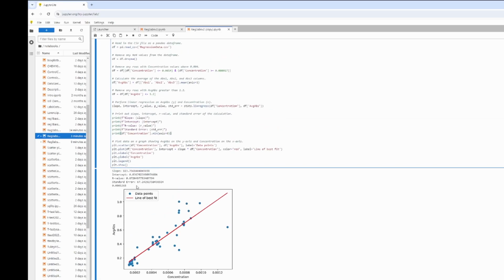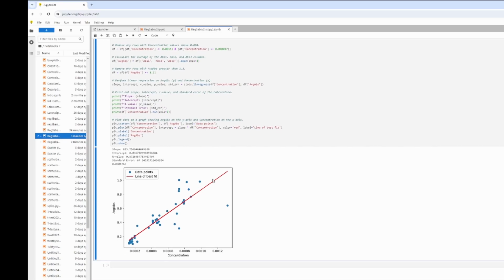Now, obviously we're not getting this on the plot, and that's fine for what we're doing, because when you submit these, you'll submit the Jupyter Notebook file, which will have this information either above or below your slope and data points here like this.